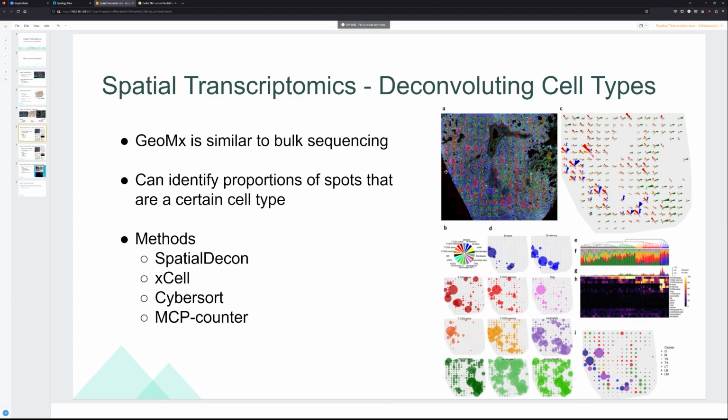Something to pay attention to here is that there are no cells being identified on what would potentially be the background H&E image or an immunofluorescence image. So we don't see any gene expression there on our sample, right? So that makes sense. We're not going to see gene expression where, depending on the technology, there are no cells, but there may be transcripts falling outside of that, or just no transcripts at all, right? So here in the bottom right-hand side, or left-hand side, there's no sample at all, and we should not see any gene expression there. So that's more of the bulk type sequencing.